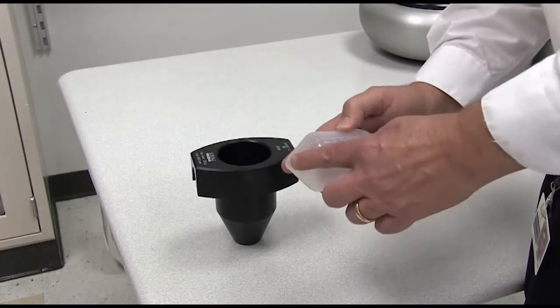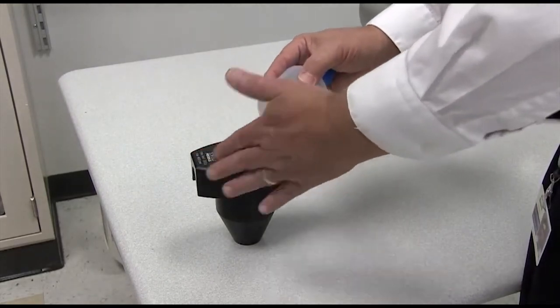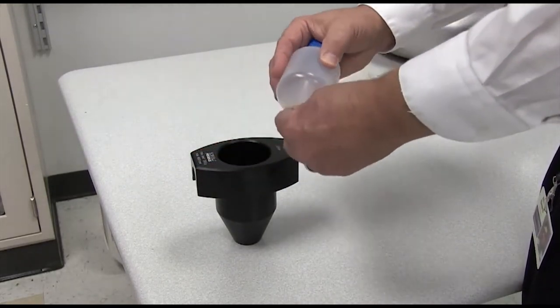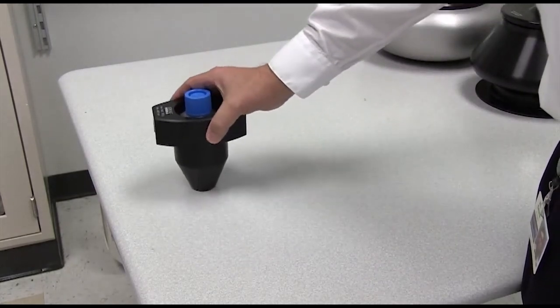very important with these conical tubes that this adapter supports this cone because with the force on this tube, it could easily compress that tube if it weren't supported.